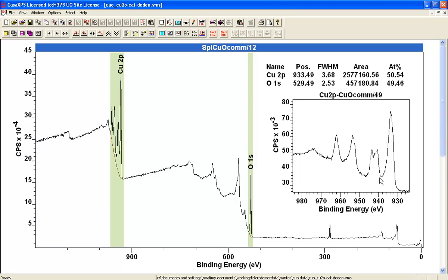And when we look at the data for the copper 2p in high resolution, you can see that there's a very characteristic structure here.